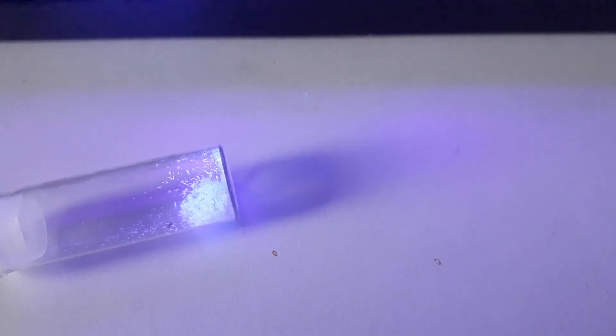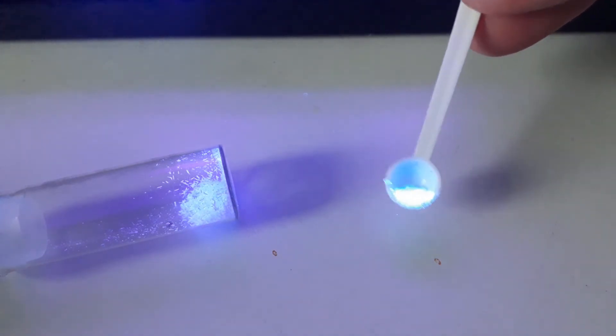Now for the final test whether this actually is our product, I will shine UV light on it to see whether it has any fluorescent properties. As you can see, it fluoresces, but not all that much. This could be due to tiny amounts of leftover anthracene. We can also compare it with the starting material, which is immensely more fluorescent under UV light.